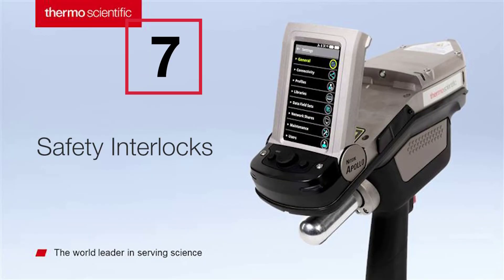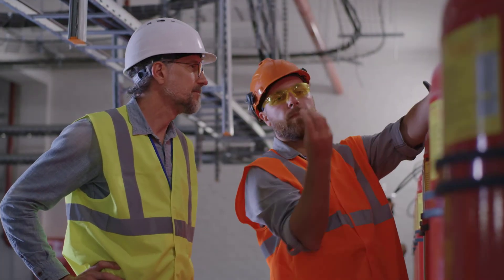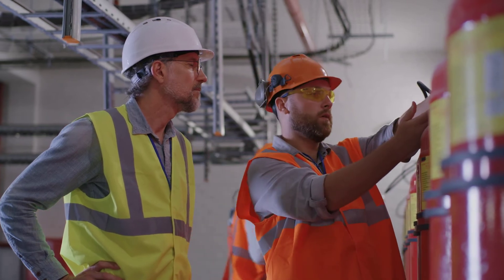Analyze with peace of mind. Integrated safety interlocks prevent laser misfire and ensure confidence in operation and results.